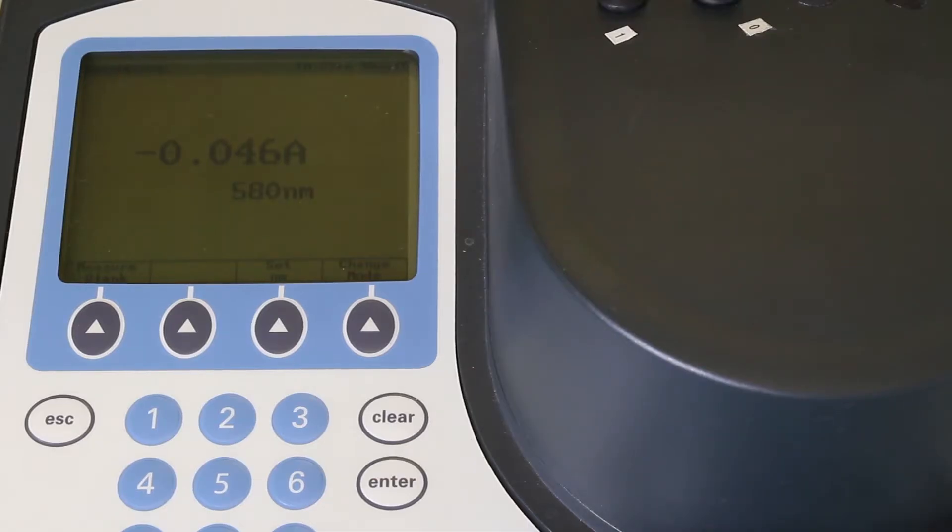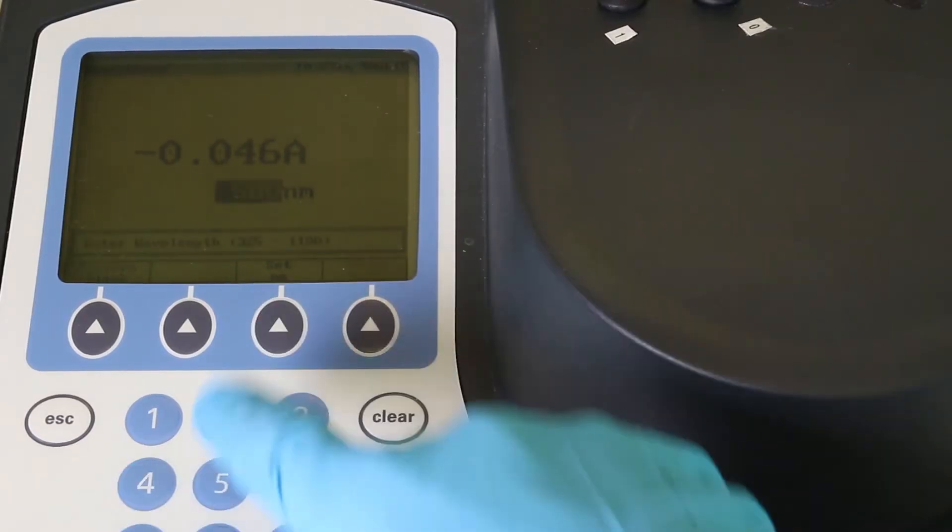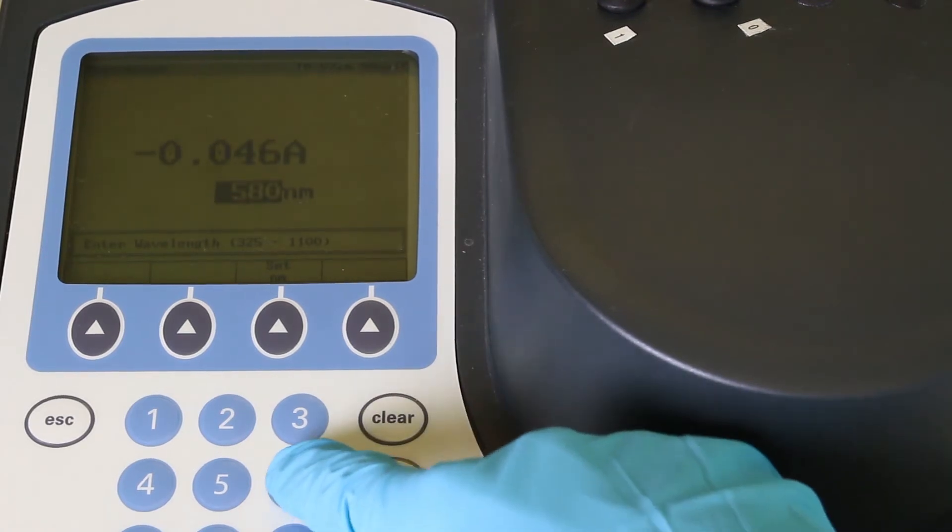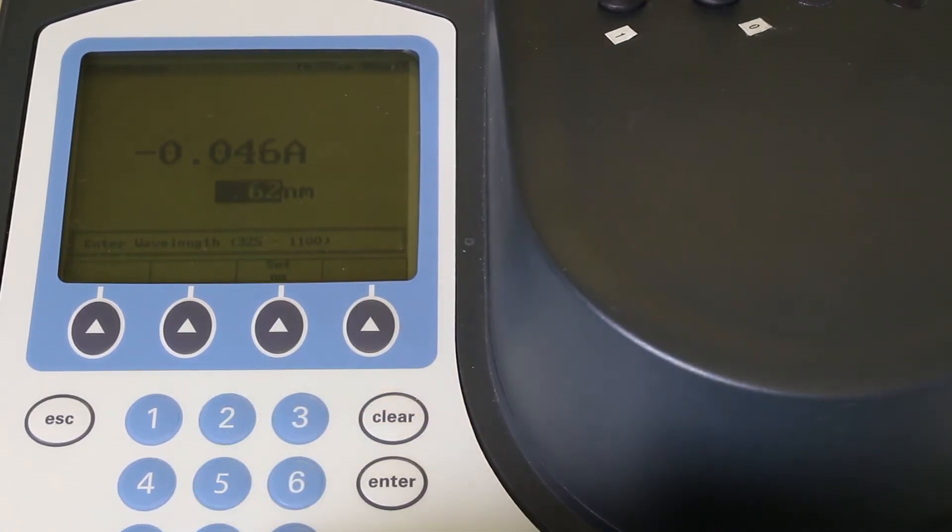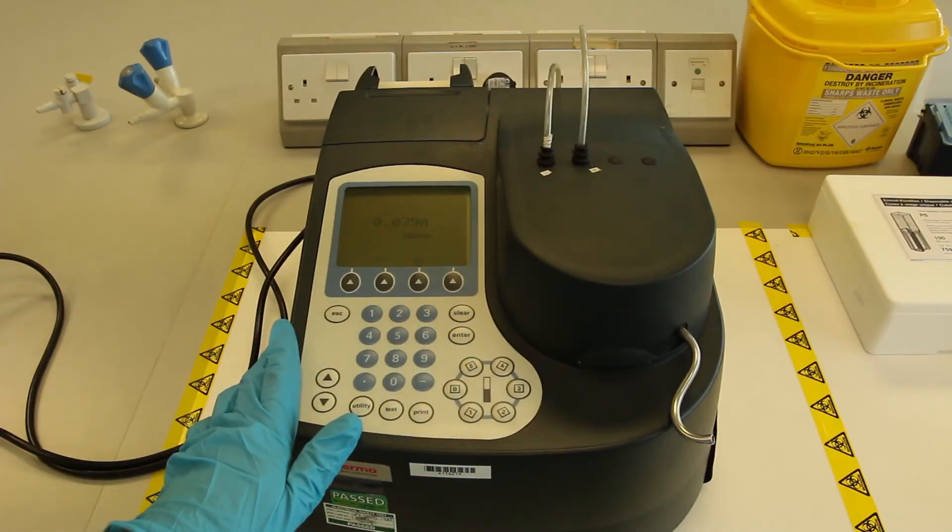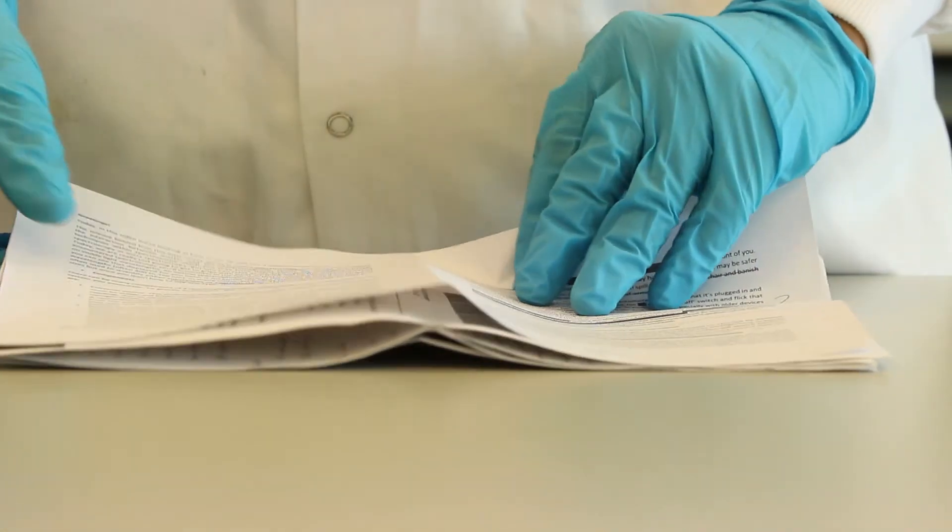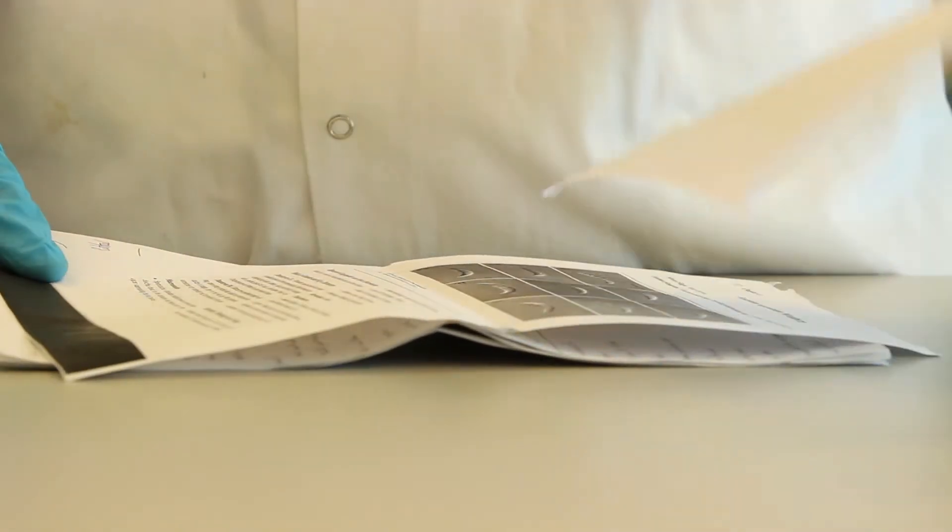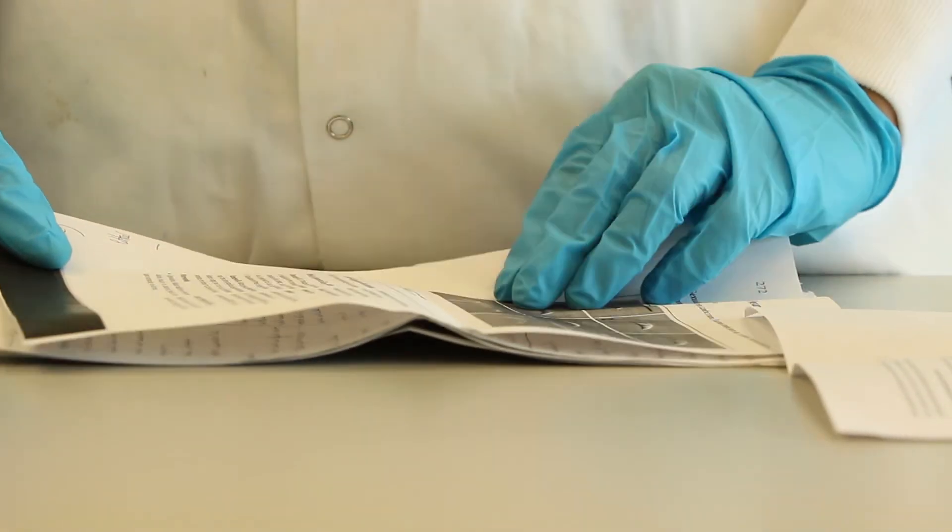Once you are ready to start your experiment, tune the spectrophotometer to the wavelength you are interested in. This will be dictated by the substance that you are studying. Thus before you begin your work, ensure that you know what wavelengths are most appropriate for the work to be performed.